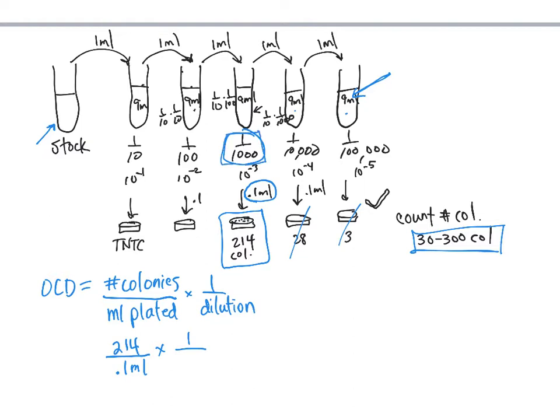And here's our dilution, 1 to 1,000. Make sure you keep this 1 here, 1 over 1,000. I know that seems a little bit cumbersome. If you actually just put 1 over 1,000 here, that's going to give you a really small number for your original cell density, less than 1. So think about it, that wouldn't make sense if you got 0.2 for your original cell density. That's less than 1 cell. Okay, this is going to be a really big number, thousands, maybe even millions.